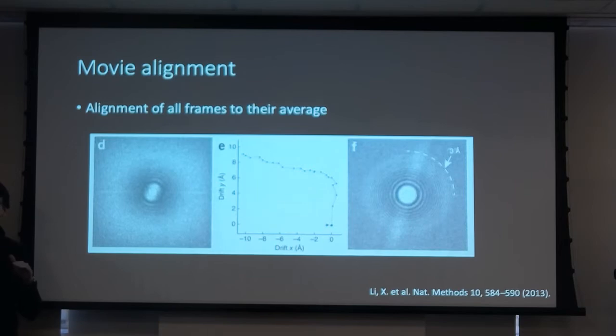As soon as you start illuminating your sample, it doesn't have structural integrity, and on top of it doesn't conduct charge very well, so it charges, and it has many different effects that make it expand. That's why gold grids are very important, those grids that have gold grid bars and gold foil, because they keep their structural integrity when you freeze your grid.